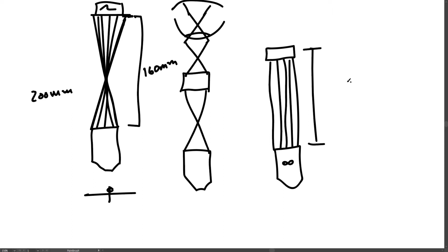And that became important for different techniques like fluorescence, where you might need to put a filter in here to collect certain types of information. So this area could be variable. You could stretch out this distance, but again, this eyepiece brings it to crossover, and then you have your eye with a lens in it, which brings it to crossover onto your retina. So these are infinity corrected objectives, and these are usually referred to as DIN objectives, D-I-N.